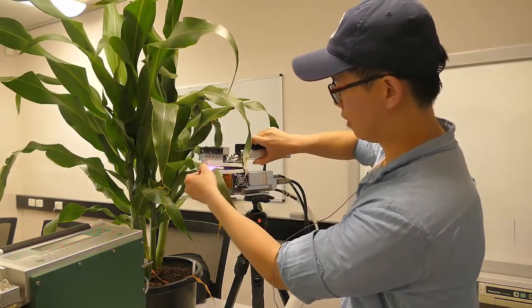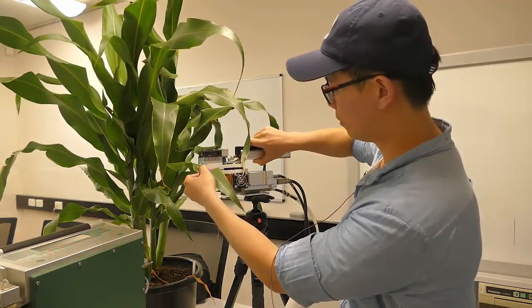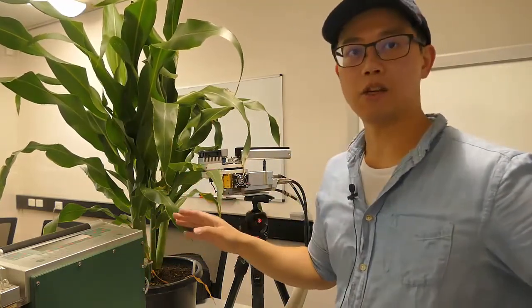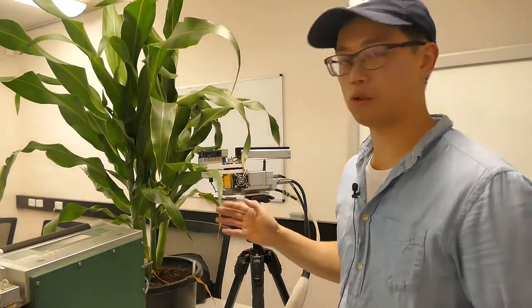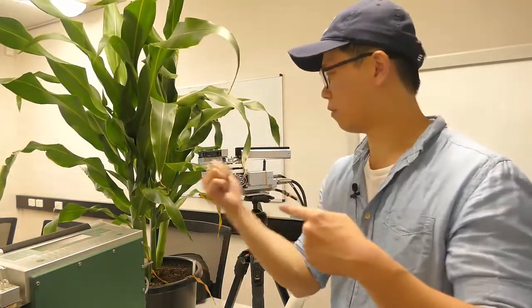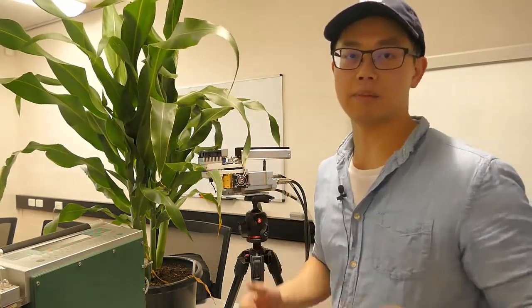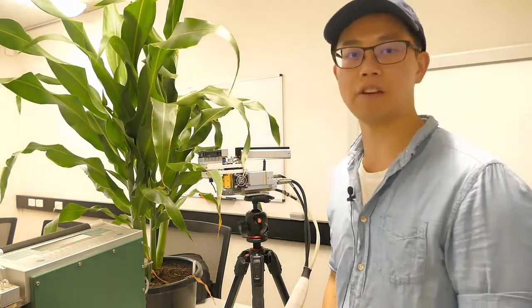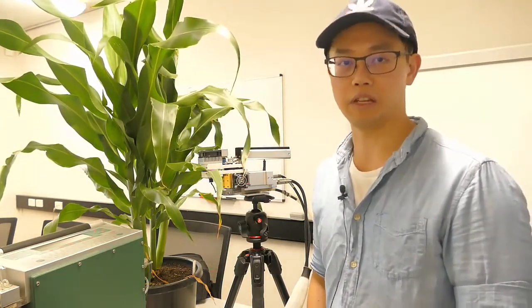Then what the machine does is it measures the change in the CO2 concentration and water vapor from the machine and out from the chamber. This way the machine can calculate and detect the differences in concentration and calculate photosynthesis and transpiration.